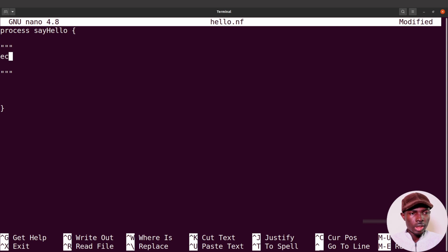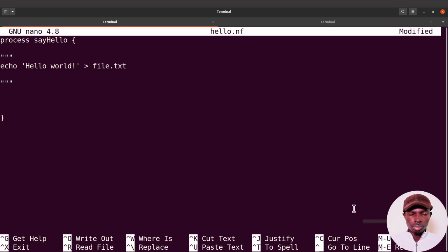We are also going to use the echo command. So echo, I bring a quote. Let me use a single quote. I'll say hello world. You can also bring your exclamation mark. That's fine. Then we direct to a file. So I'll say file.txt. You can use any name of your choice. This time you can experiment. You can go all out. That's fine. Nothing will happen. So we have this.